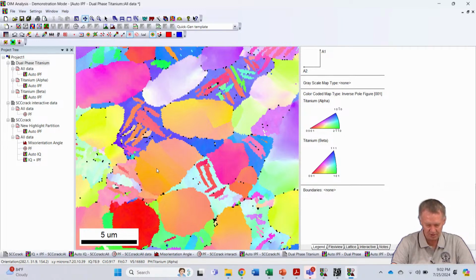So now if you look at the bottom of the screen, look down here where it says CI. See, within that grain, that's a 0.917. I don't know if you can see that up there, but that's 0.917 in that grain. And as I go through the different XY positions, it's all 0.917. So over here is, again, a 0.917. This is a 0.857. But that whole grain then will be the same confidence.